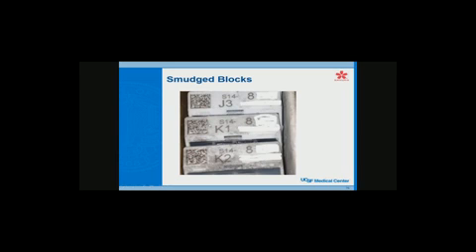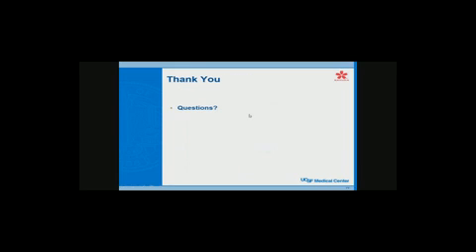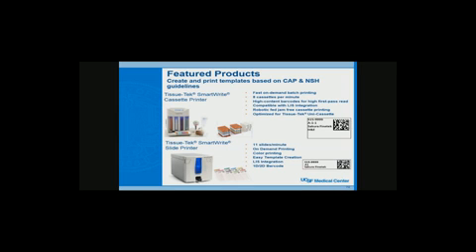Our general label, just a few pictures here. This is our consult labels, slightly different color, designed to stick to a person. Then our pathology label, this is our old label, this is our new label for the SciTech machine. You still have problems with grossing. If they put much ink and it leaks out, it can affect the barcode. These wouldn't read. We had to reprint these cassettes.